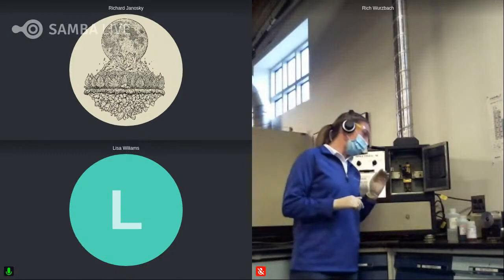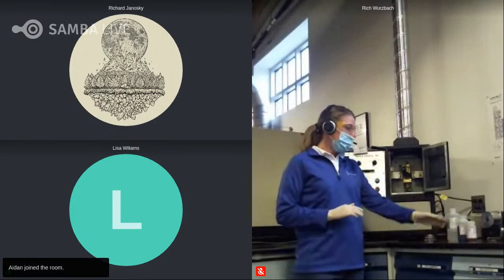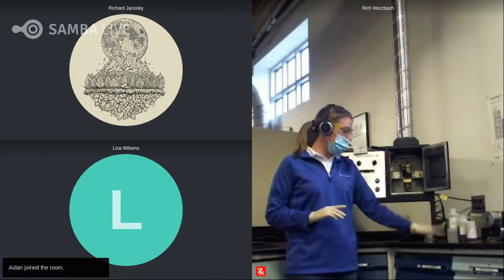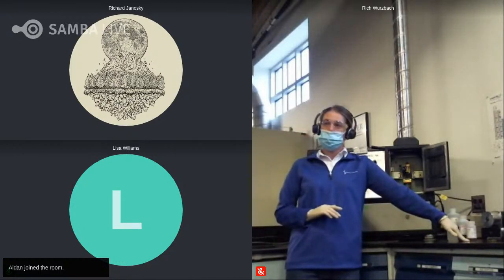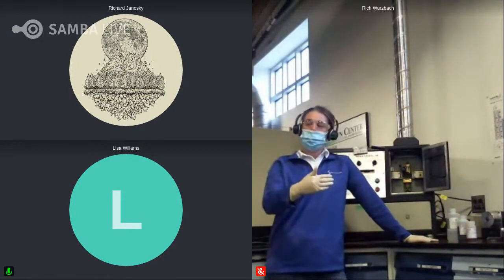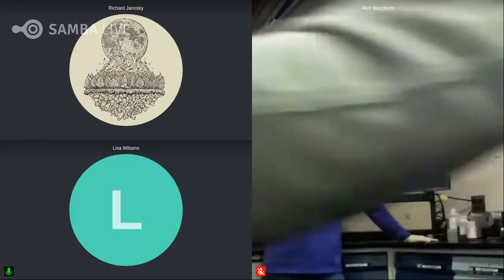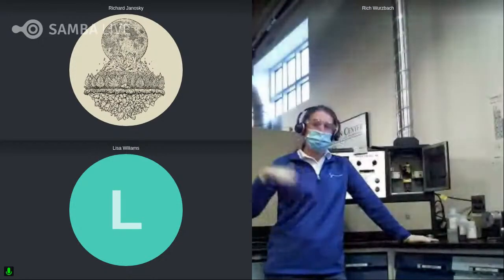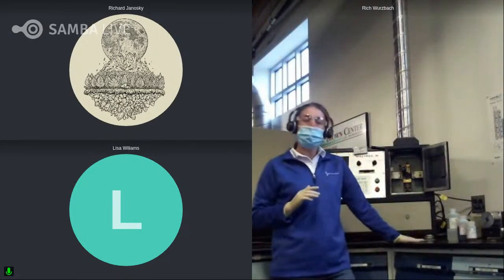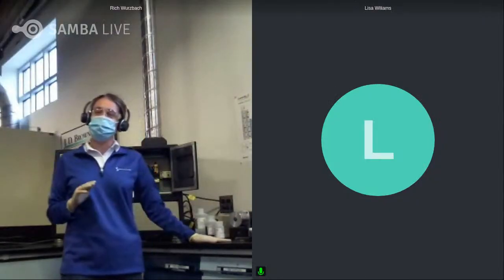Like Richard mentioned in the presentation, MRG has their standards laid out here. So they have 0, 100, and actually I'm mixing them going backwards here, so 0, 100, 900 parts per million. Like we've said a couple times, a lot of our greases, especially in the grease realm, in the oil realm this isn't an issue. 900 ppm is usually plenty. But in the grease realm, we're usually seeing values that are well above 900 parts per million. So being able to extend that calibration range is going to be helpful in some cases.